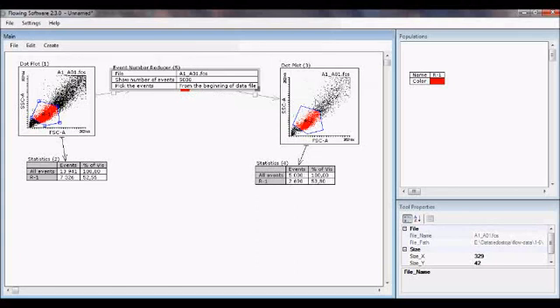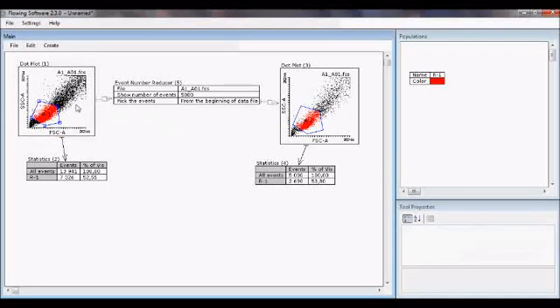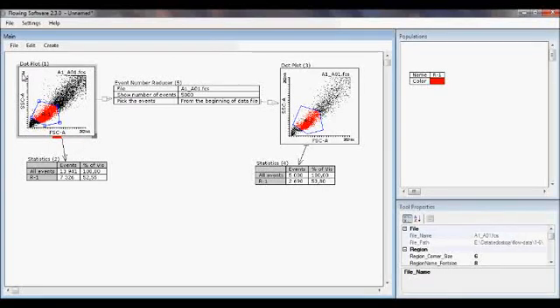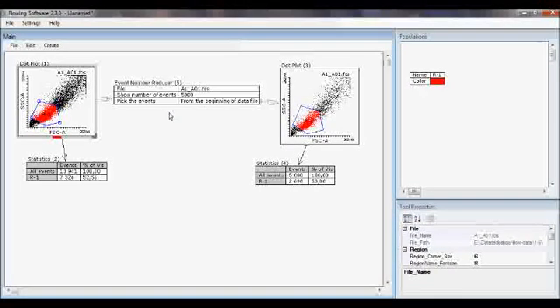And now when I connect these, now you can see that this contains only 5000. But the point is that here the master still contain all events. So the idea is that whenever file goes through this, this will create a new instance from that file, make the modification, and then sends it forward. So this original file remain here unaffected. Anyway, by the way, the original data files will remain unaffected, but this also you can use these files still before change and after change. This is the tool which makes the new instance of the file.